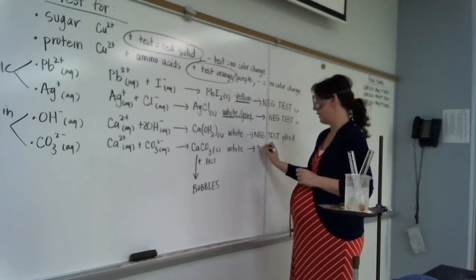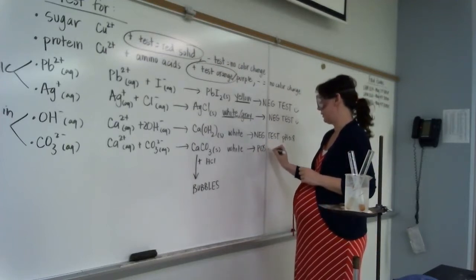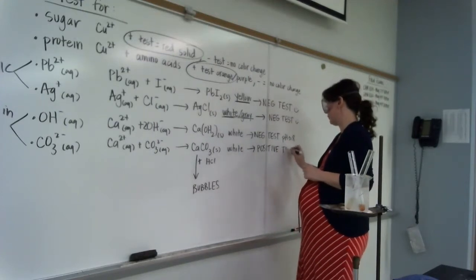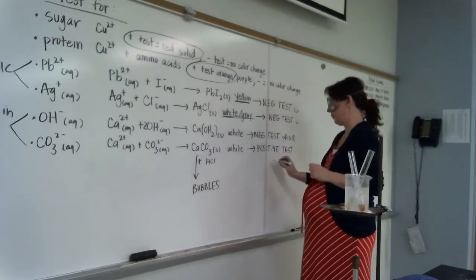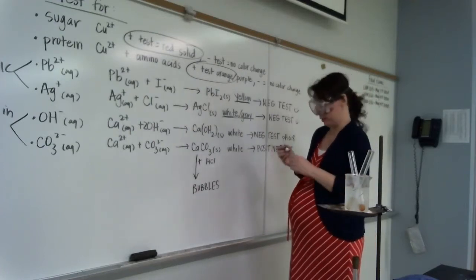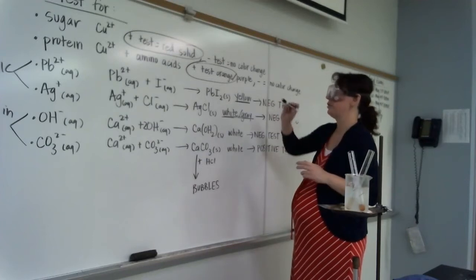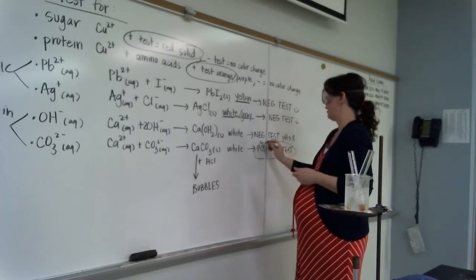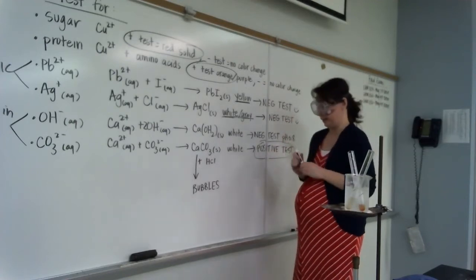And this is a positive test. Because we got bubbles. And makes sense, we've got hard water in this area too. So we had 1, 2, 3 positives and 1, 2, 3 negatives.